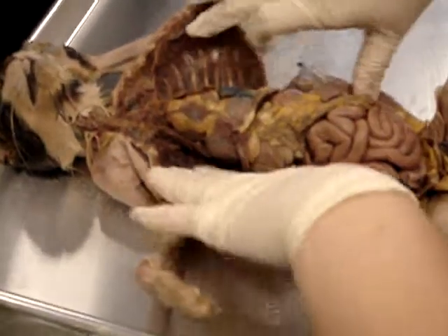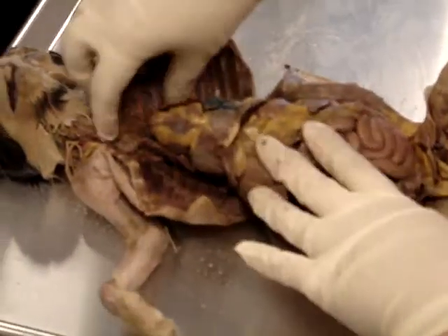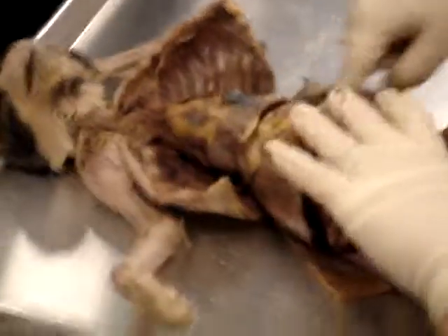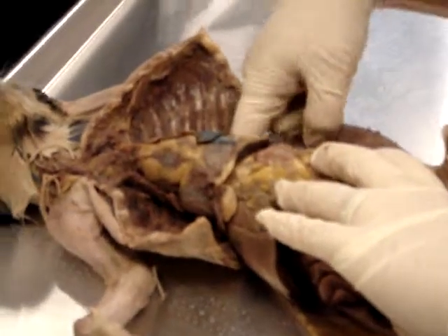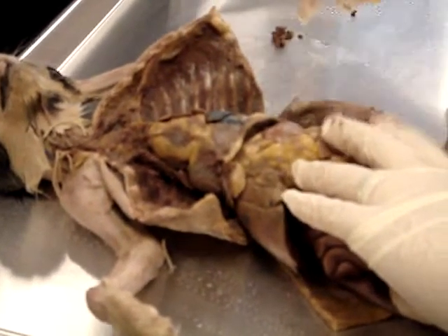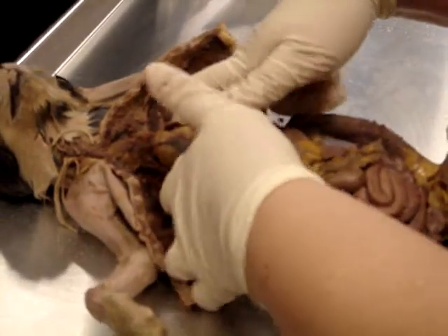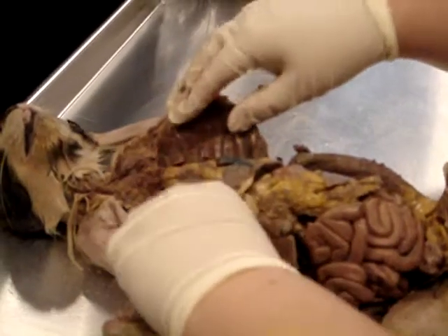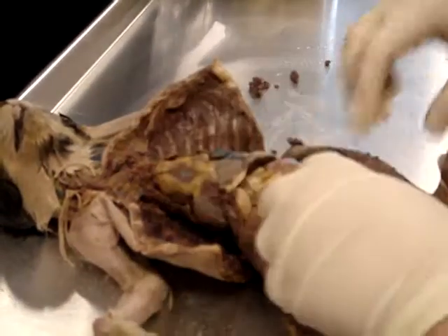Okay, so one thing you'll see right away is sometimes you'll see some of this brown goo. What is that? It's coagulated blood. So when they die, some of the blood leaks into their abdominal and their thoracic cavity. So any of that business, if there's a lot of it, you might even want to rinse your cat out just to get it all out if there's a whole lot of it. But you can just kind of pick any of that out, okay?